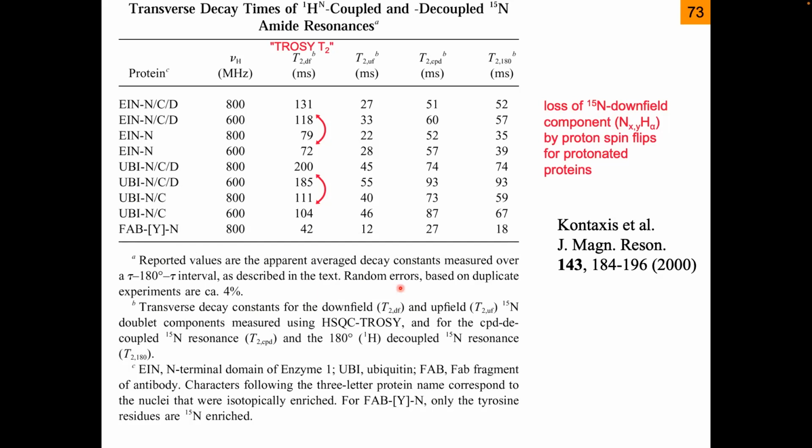This HZ will make NOEs to other protons and thereby relax. And the same thing happens in the TROSY sequence. Now, in the TROSY sequence, you are interested in the proton H alpha state. When the nitrogen is transverse, you want to keep this in the H alpha state. And this is a kind of proton polarization. But this proton polarization will again make NOEs to nearby protons and will be relaxed by this.